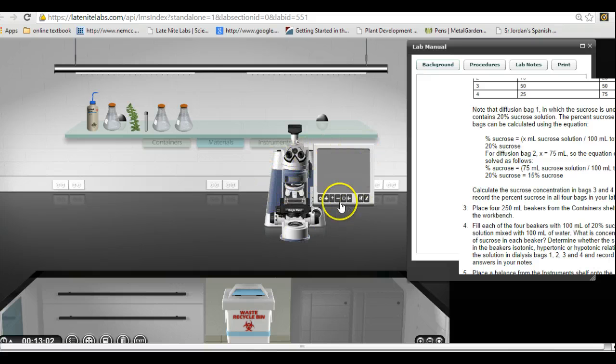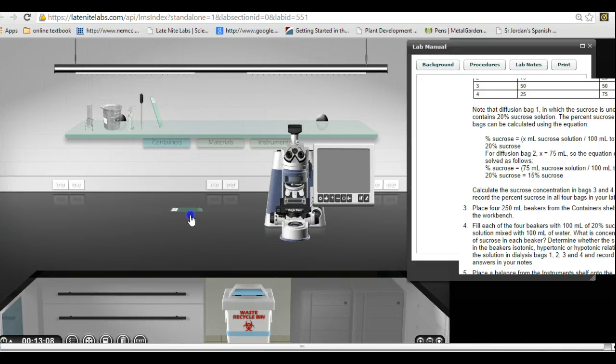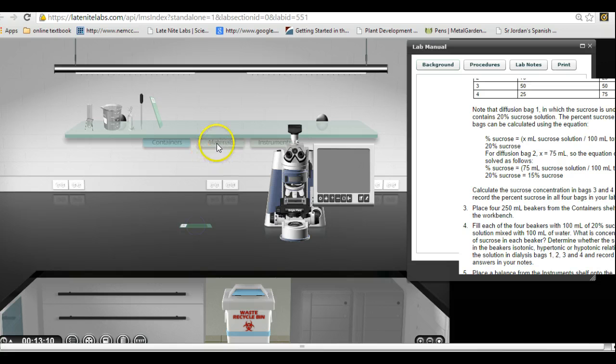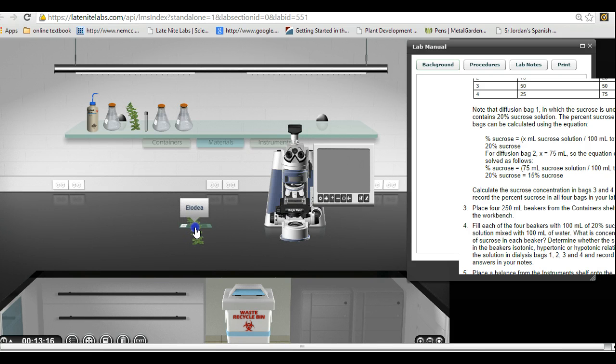Now I've got the microscope out here on the bench. I'm going to go over here to containers, get a blank slide, and put that on the bench. Then I'm going to go to materials. This is where I think you were having trouble, and I had some trouble with this as well.